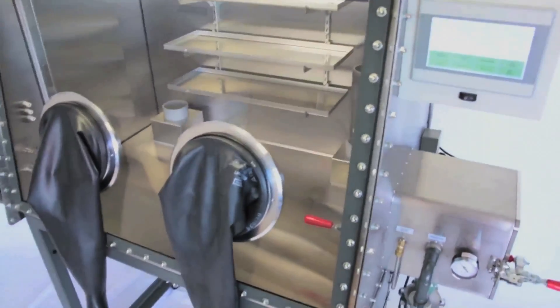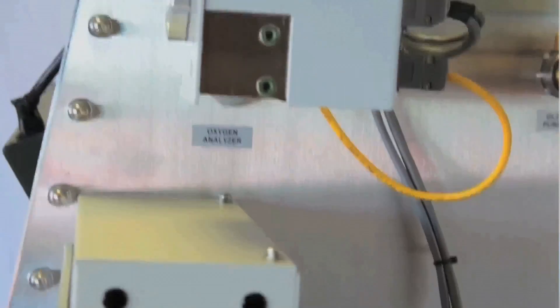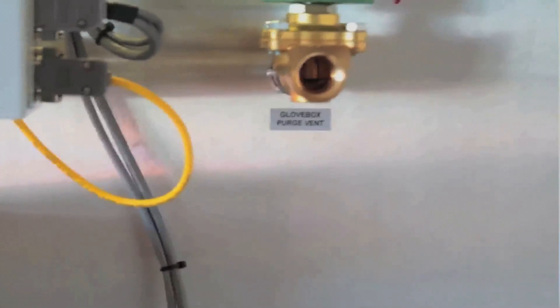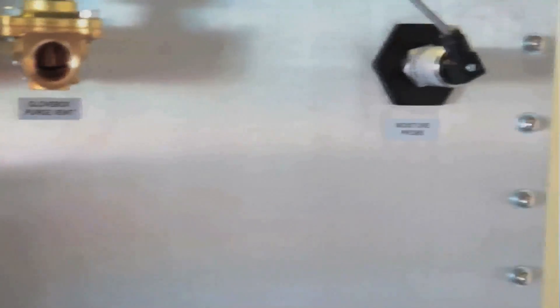This new inert gas purification system does not require regeneration by you, which means no downtime, no forming gas in the lab, and minimal cost of ownership.